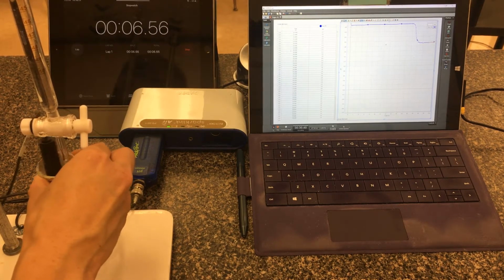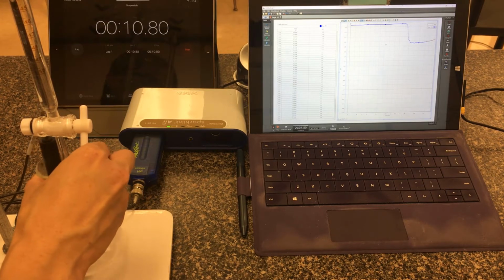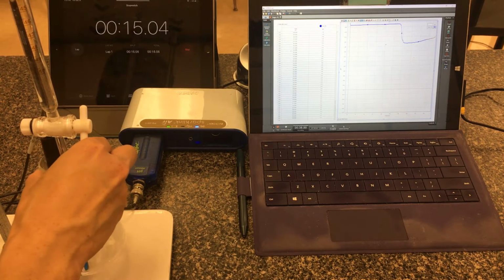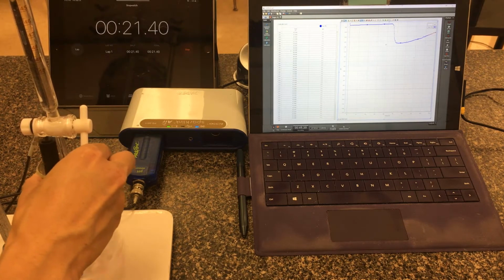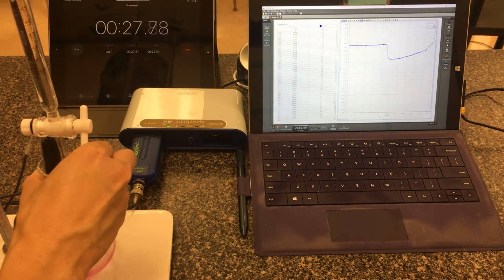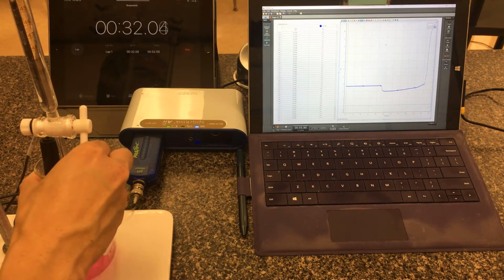So basically the base is going into the Erlenmeyer. The phenolphthalein is sensing that there's base inside, so it's pink. And then as the base finds our unknown acid, it neutralizes, and the pink color disappears. Okay. Right now we've dropped in about 12 milliliters, just so we can get a sense of the flow rate. Normally for titration, when it hits a pink color like this, we would want to stop. We would say, oh no, we've overshot.